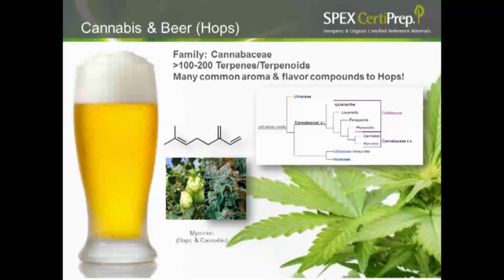When we look at the pesticide levels in the hops, we saw the most pesticides in the hop products of any of the other constituent components, or even as of the finished products. We saw ethion from 1.6 to 9 ppm in most hop varieties. So you can see that the ethion was found in 3 out of 4 of our hops varieties.